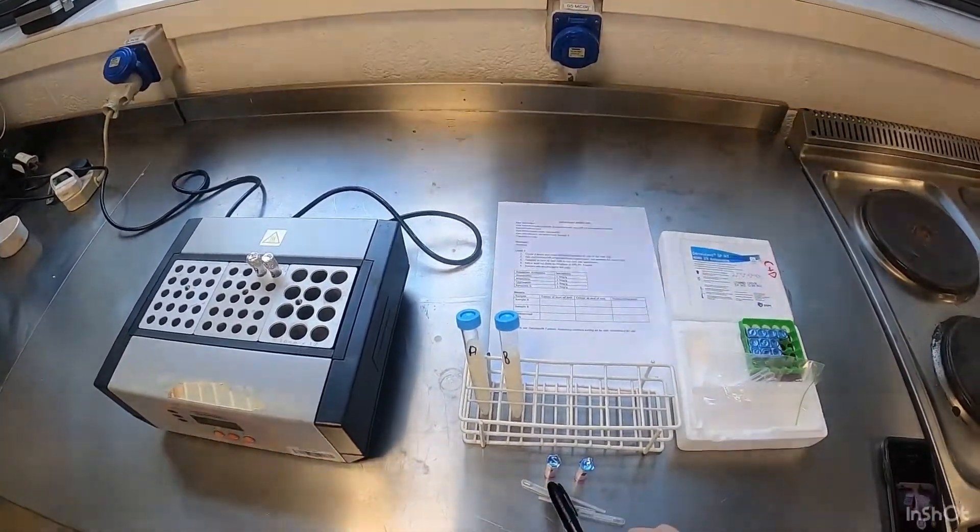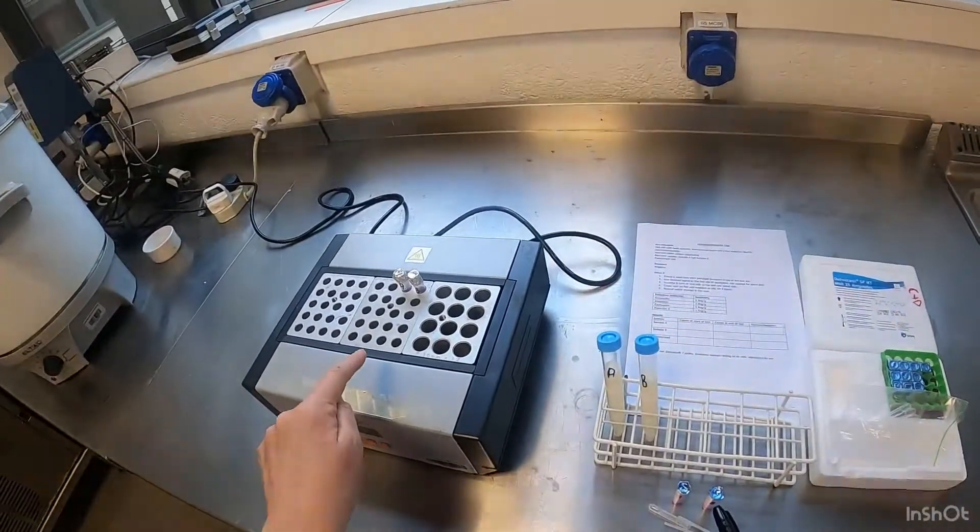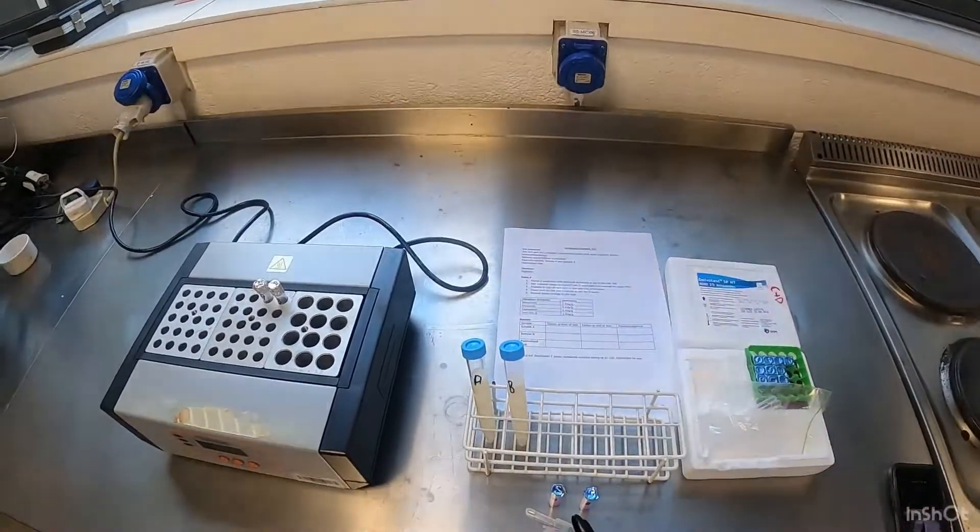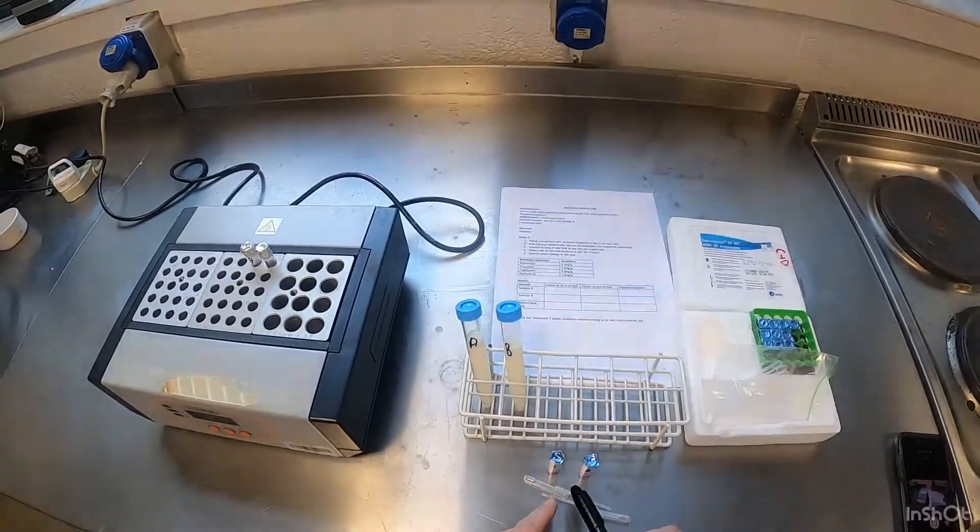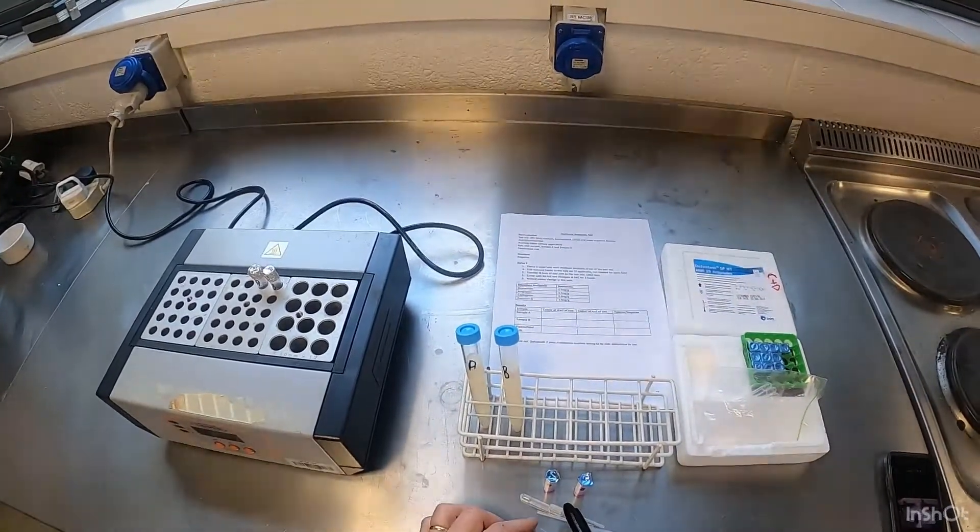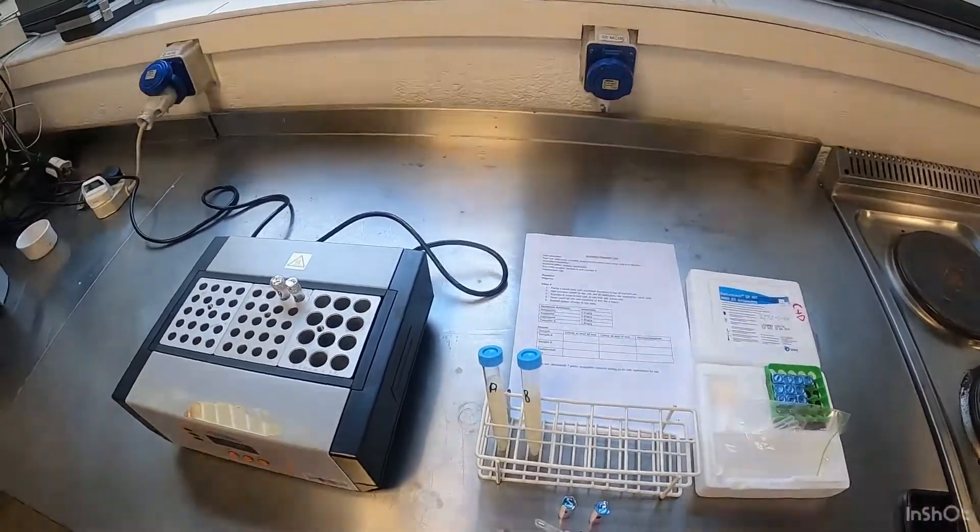So there's a bacteria growing in this and when we put it into the heating block here it should grow. However, if there's an antibiotic present in this sample of milk, then it will stop the bacteria from growing. And it all comes down to a colour.